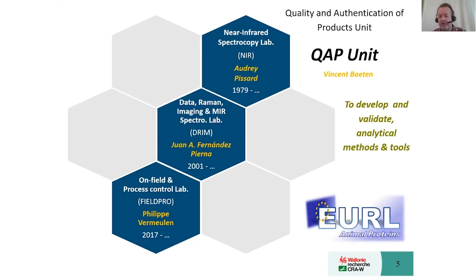I will just present to you very shortly some issues we are trying to tackle. And there we are really in the lab-to-the-sample approach. It means that we go with the lab to the samples. That's changed our mind a little bit. And we created a specific unit for that because we believe that vibrational spectroscopy is maybe one of the best techniques to do analysis online, on field, in the orchard, in the greenhouse, and so on.